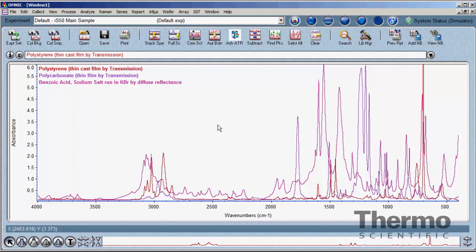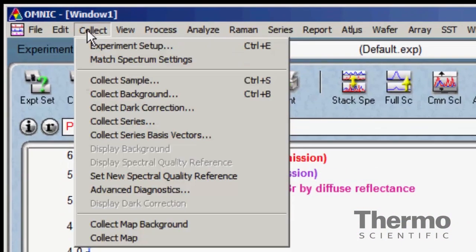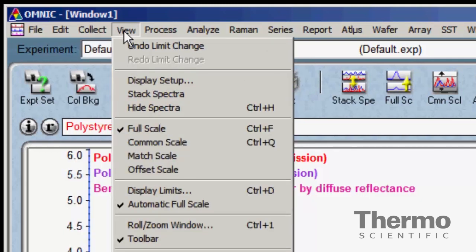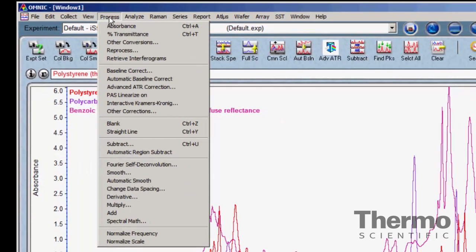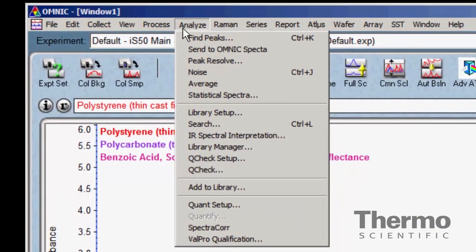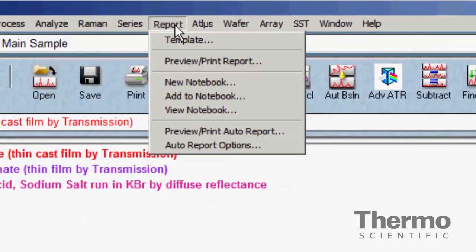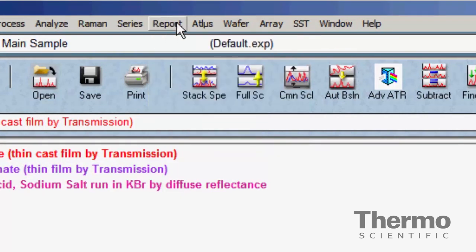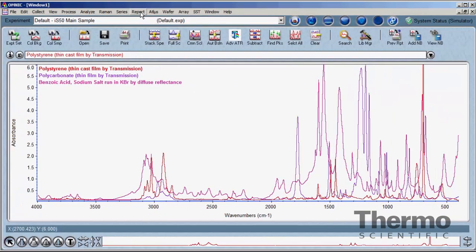The core group of menus is arranged in the order of a typical experiment. The Collect menu contains commands that access the parameters needed to collect a spectrum and initiate data collection. The View menu has commands that adjust the display of data after collection. The Process menu contains functions that convert, combine, and correct spectral data, preparing it for analysis. The Analyze menu is where commands to extract information from spectral data are found. Lastly, the Report menu contains commands for formatted reporting and archiving of analysis results. Keeping this flow in mind will help you remember where to locate the various tools.